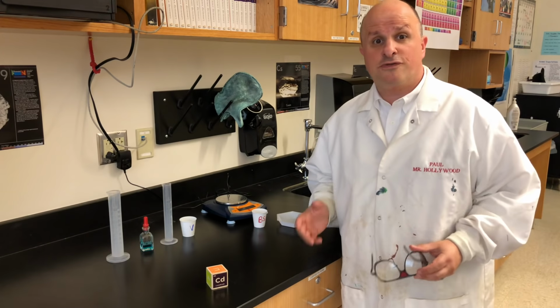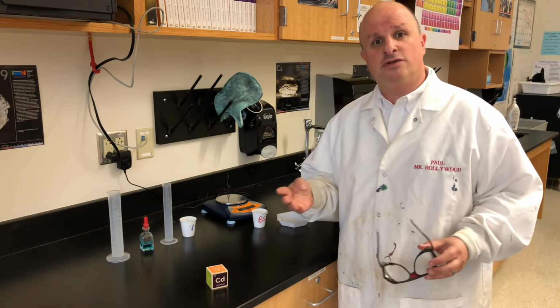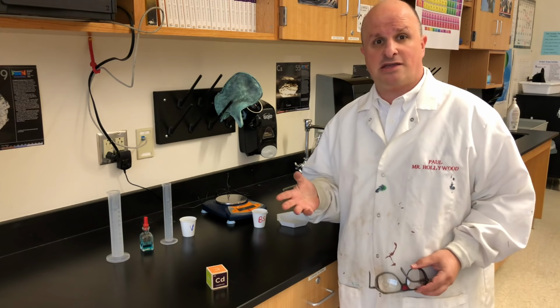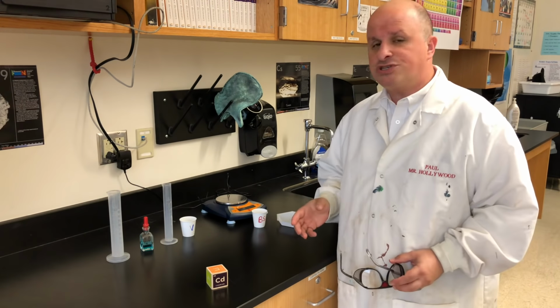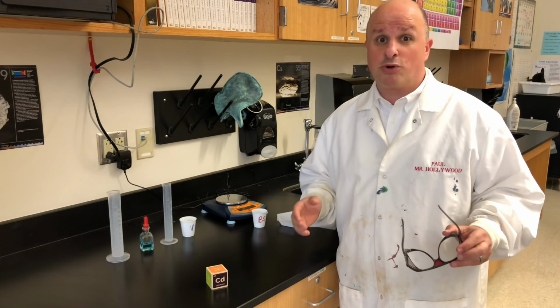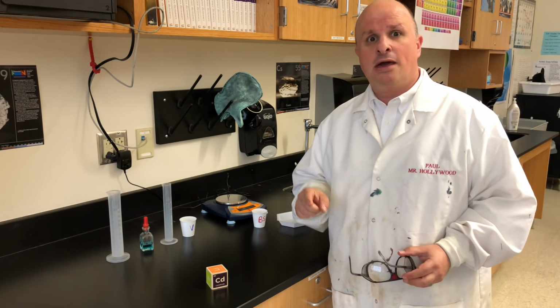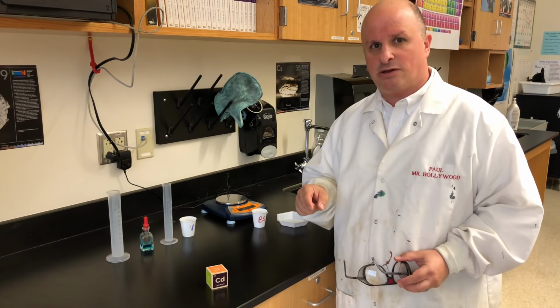All right, guys, welcome to your first lab of Labapalooza. Labapalooza is a 4-day festival of labs where you learn the 4 different signs of a chemical reaction. Our first sign of a chemical reaction is gas formation. That's right, we're gonna make gas. Now, some of you do that on the regular in my class anyway, but this is a special kind of gas that we're gonna make, okay?